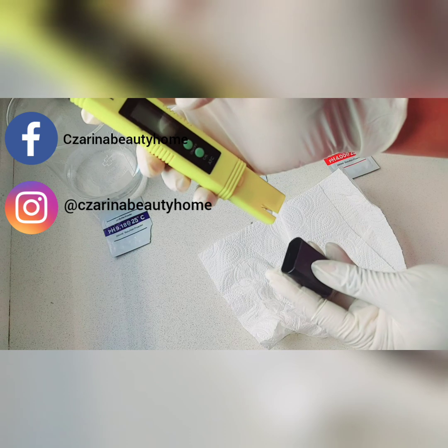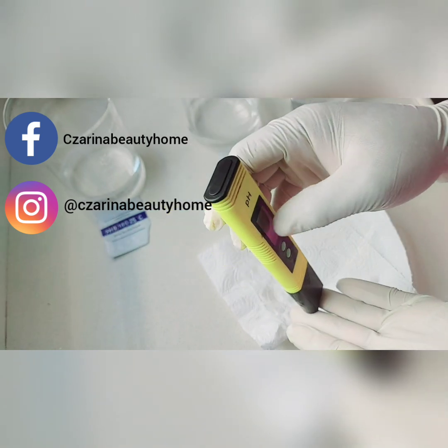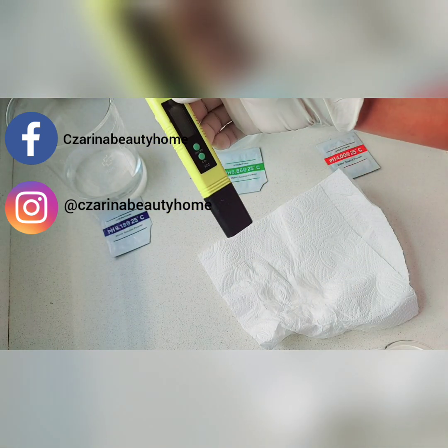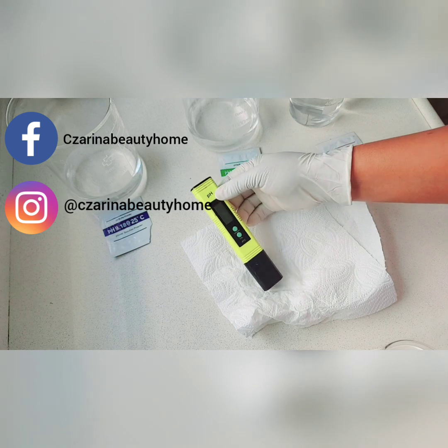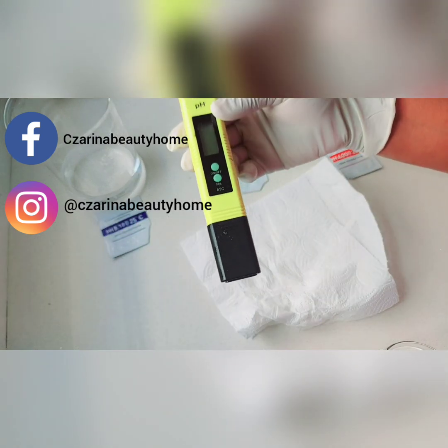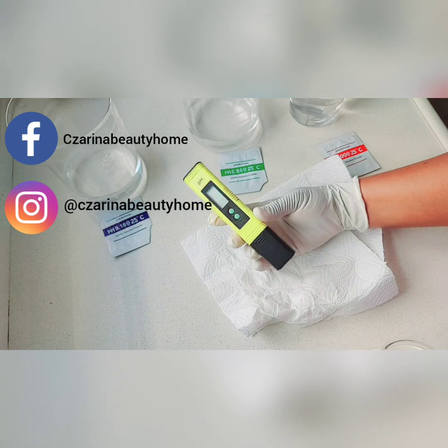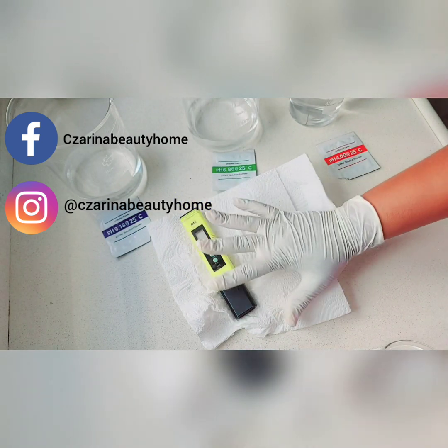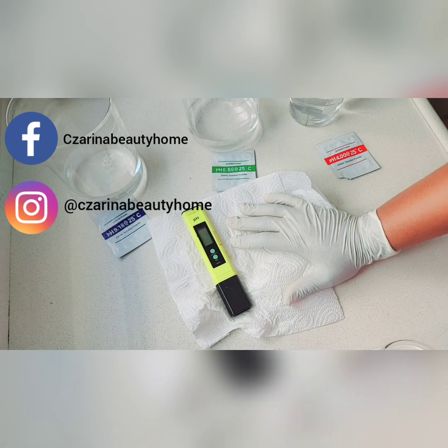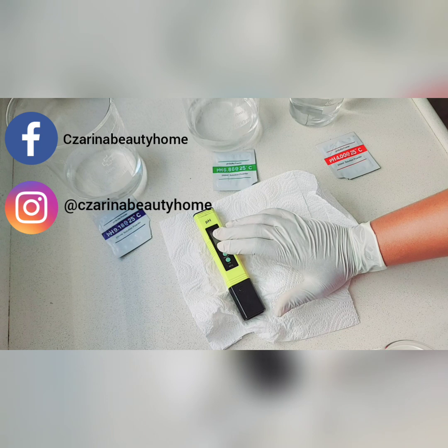If you're the type that formulates every day or every other day, you don't need to calibrate it every single day — at least use it for about a week, then calibrate. How do you know your pH meter needs calibrating? Once you dip it in and it keeps reading, fluctuating and not stabilizing, calibrate it. Especially when you're working with acid-based products or making serums, it's important to calibrate. If you don't calibrate, you won't get the right figure, you'll ruin products while trying to adjust the pH. Calibrate your pH meter each time you want to use it and you'll get an accurate figure.